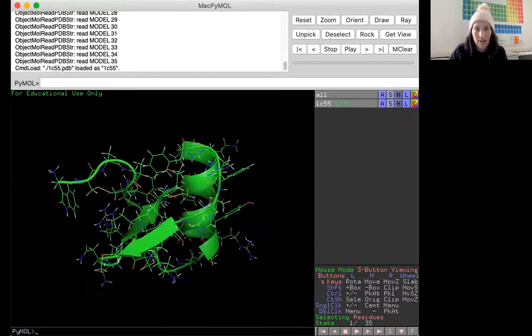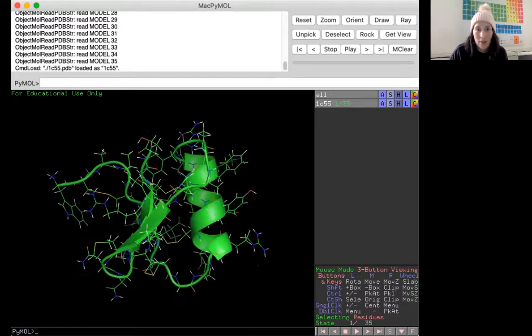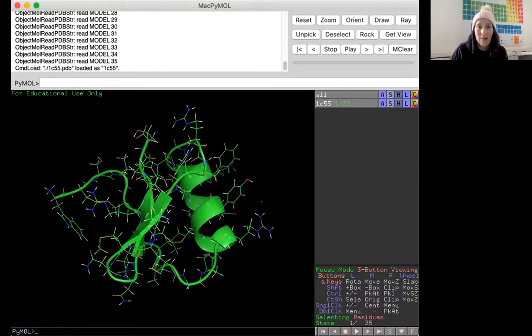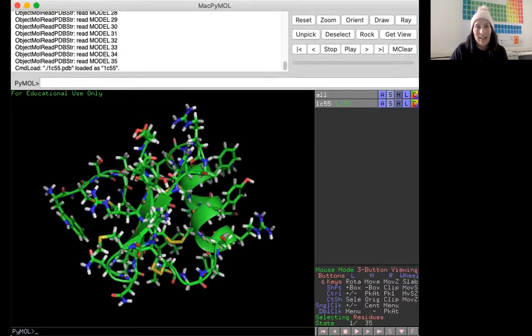What do we have down here at the very bottom of this alpha helix? I see an arginine because I see a lot of green carbons and then 3 nitrogens with a carbon in the center. That's that guanidinium moiety. So there's an arginine. Oh, look, here is a tyrosine right here, right above it, because it's got the ring, but the alcohol with the oxygen that's red, right? So you can start to identify amino acids right off the bat. That's lines. I think lines are ugly, so we're going to hide the lines. Let's show the sticks. So sticks are going to be a little bigger, okay?